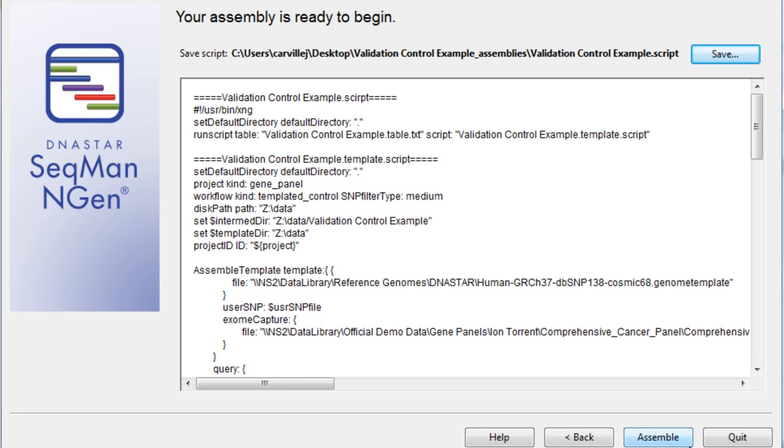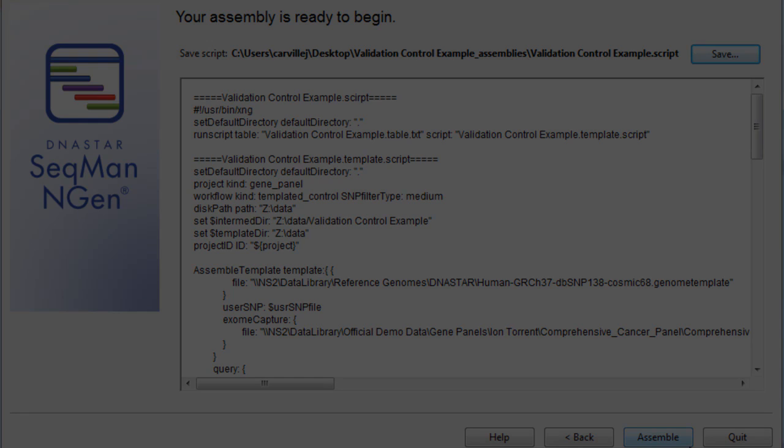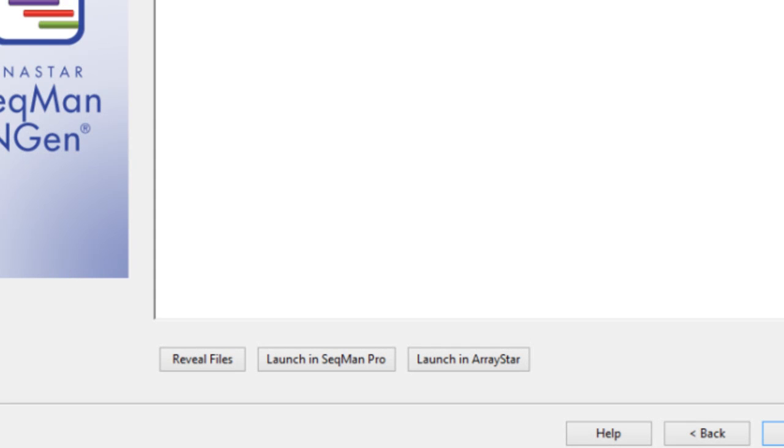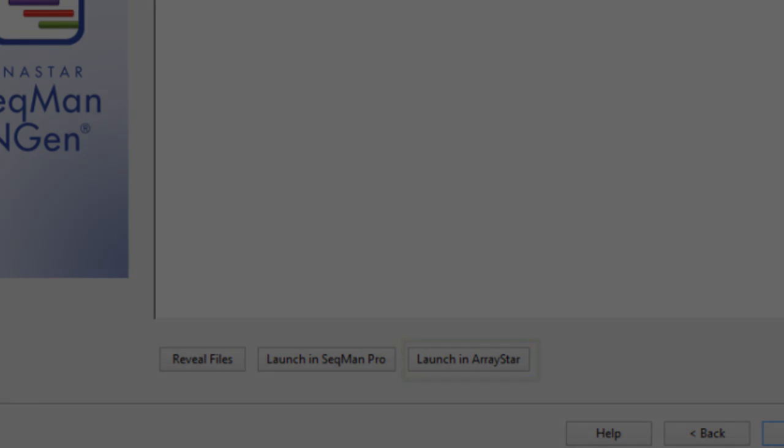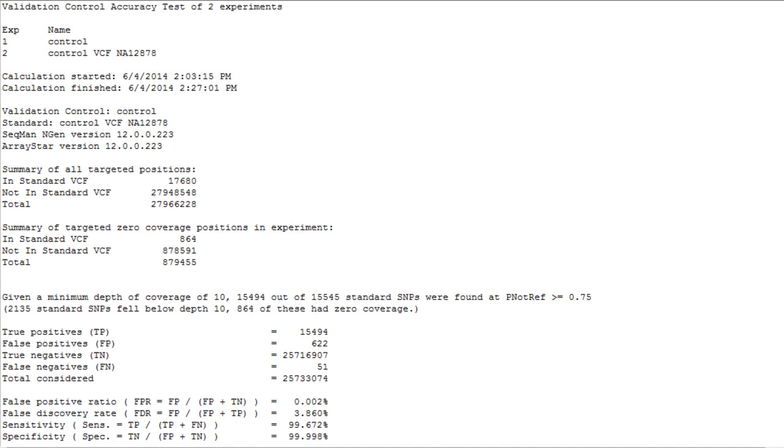And finally, you can choose to click Assemble to begin to run your assembly. When your assembly is complete, you can directly launch your project in ArrayStar. ArrayStar will automatically group your experiments and generate a validation control report, which we're looking at here.